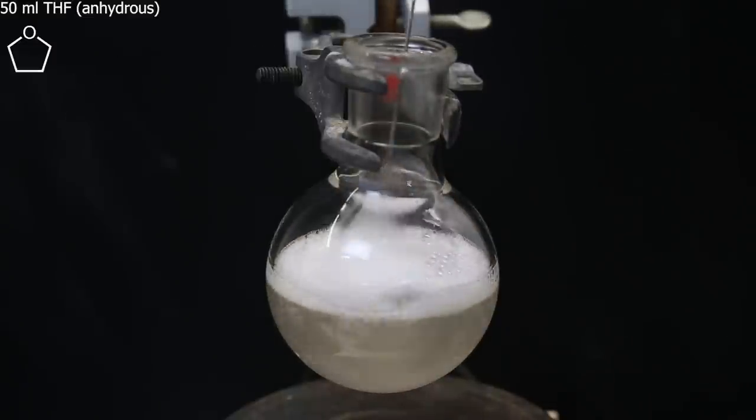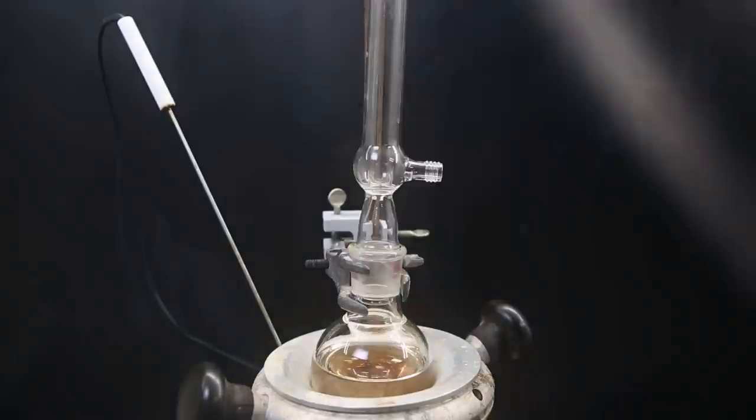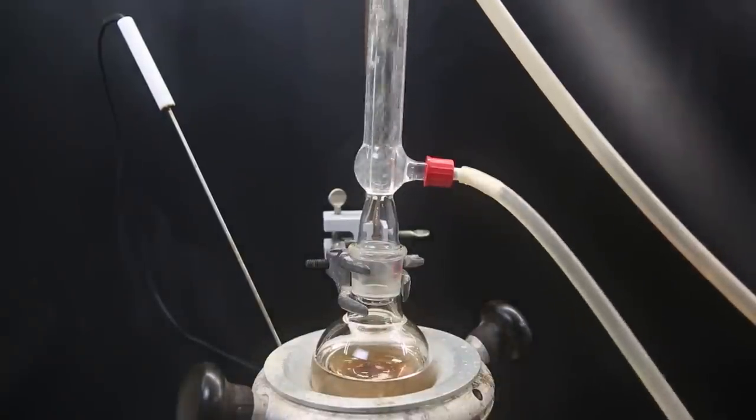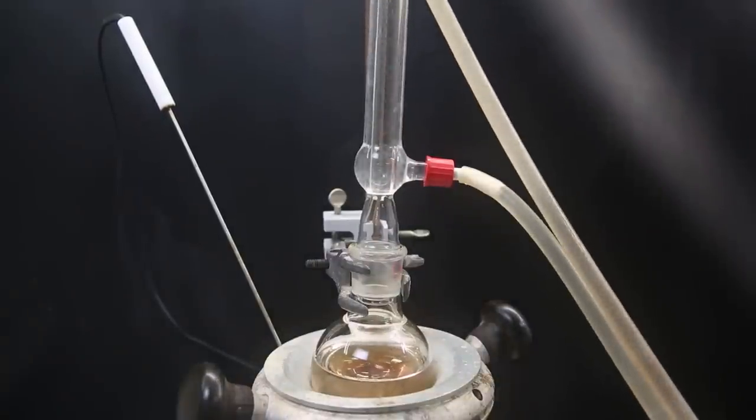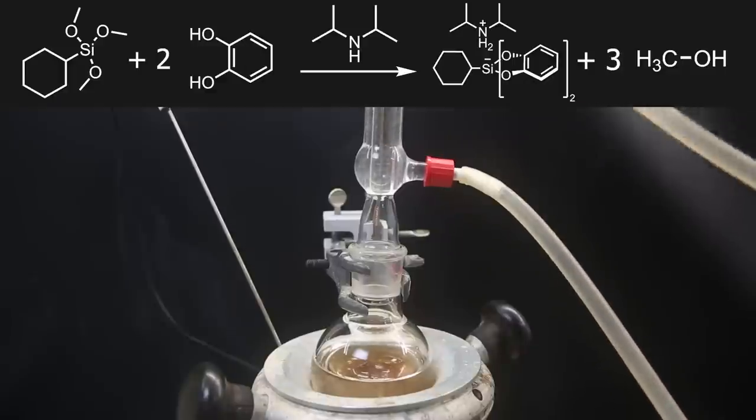I dilute the mixture with 50 more mL of THF, and then set the flask in a heating mantle and attach a condenser. I start heating the mixture to a reflux, and then leave it for a day. In the reaction, the hydroxyl groups from catechol will react with the methoxy groups and produce methanol.